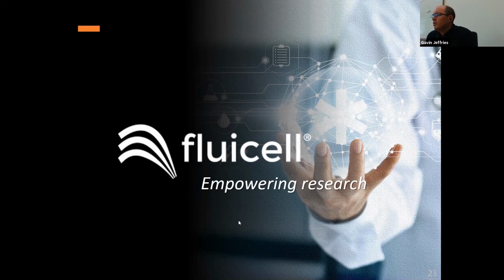They can go into multi-well platforms. Currently, we don't normally go above 12, like a 12-well plate. Going significantly beyond that is outside of the current, not the technology's limitations, but the fabrication limitations to make tips that sharp and that kind of flexible. But we do have the ability to go to 12-well plates currently.